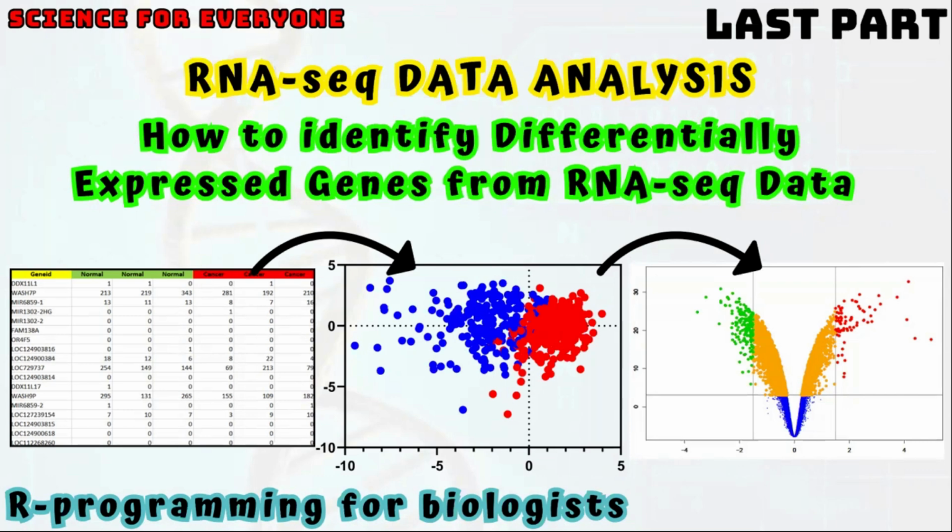I discuss NGS data and the NGS experiment, what FASTQ files are, the Linux operating system, and each and everything. So this is a complete playlist of 18 videos. I tried my best to teach you RNA sequencing data analysis. I assure you that if you start from the very beginning, your time will not be wasted, and you will learn a lot of things related to bioinformatics, especially RNA sequencing data analysis.